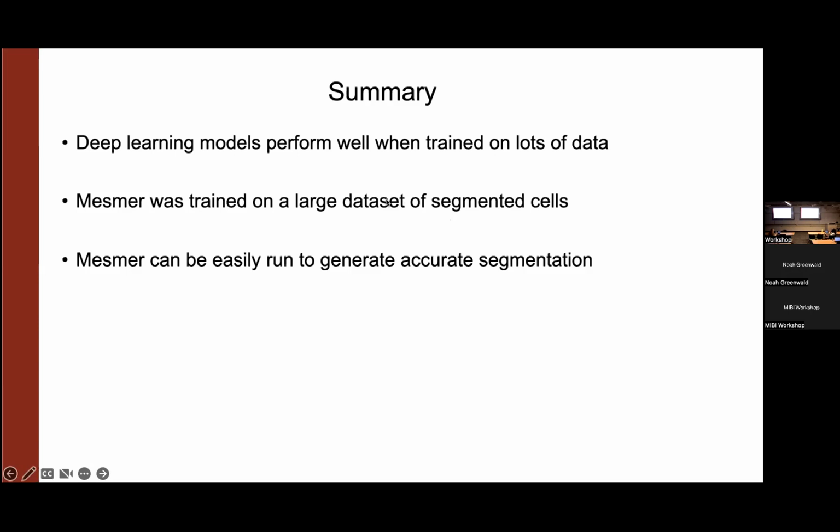Can I pass a nuclear marker as a membrane to segment only the nuclei, or should I use another method? So that's the great thing about the model. If there's not a membrane marker, so if you remember from one of those first images I showed, some of the cells had keratin as a membrane marker, but some of them didn't. And you don't just have to give up.